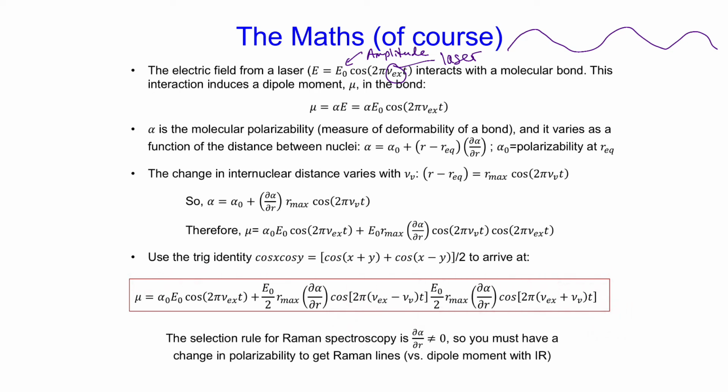Now we'll hit the highlights of what that expression tells you. I know this looks a little bit overwhelming in its form, but we can easily pull out the information that we want about our scattering processes that are happening in our experiment with this equation. The key is to look at the frequencies of each term. Oh, and there's a missing positive sign there, so this is a third term. So let's zero in just on those frequencies that show up in our electric field.